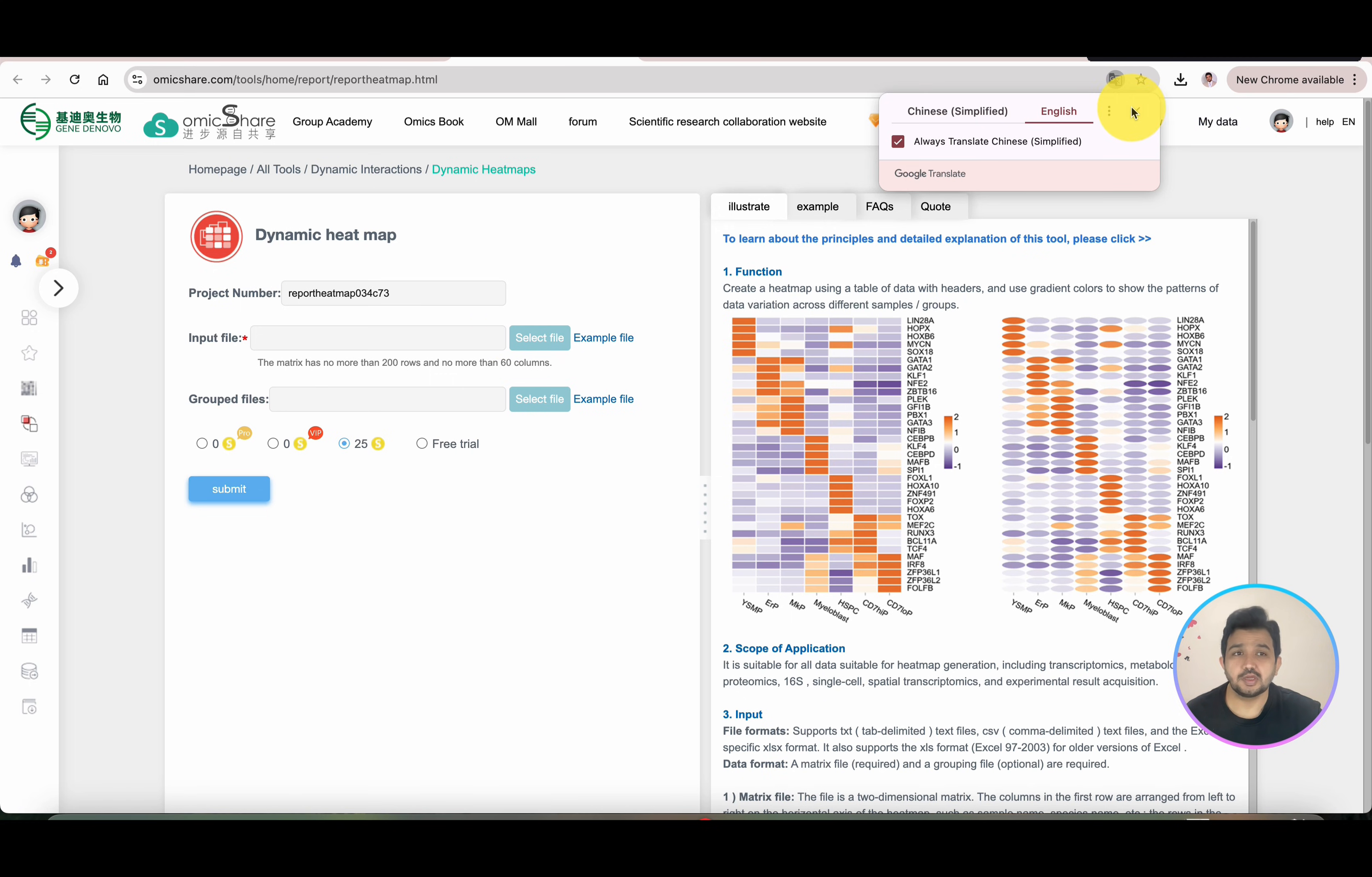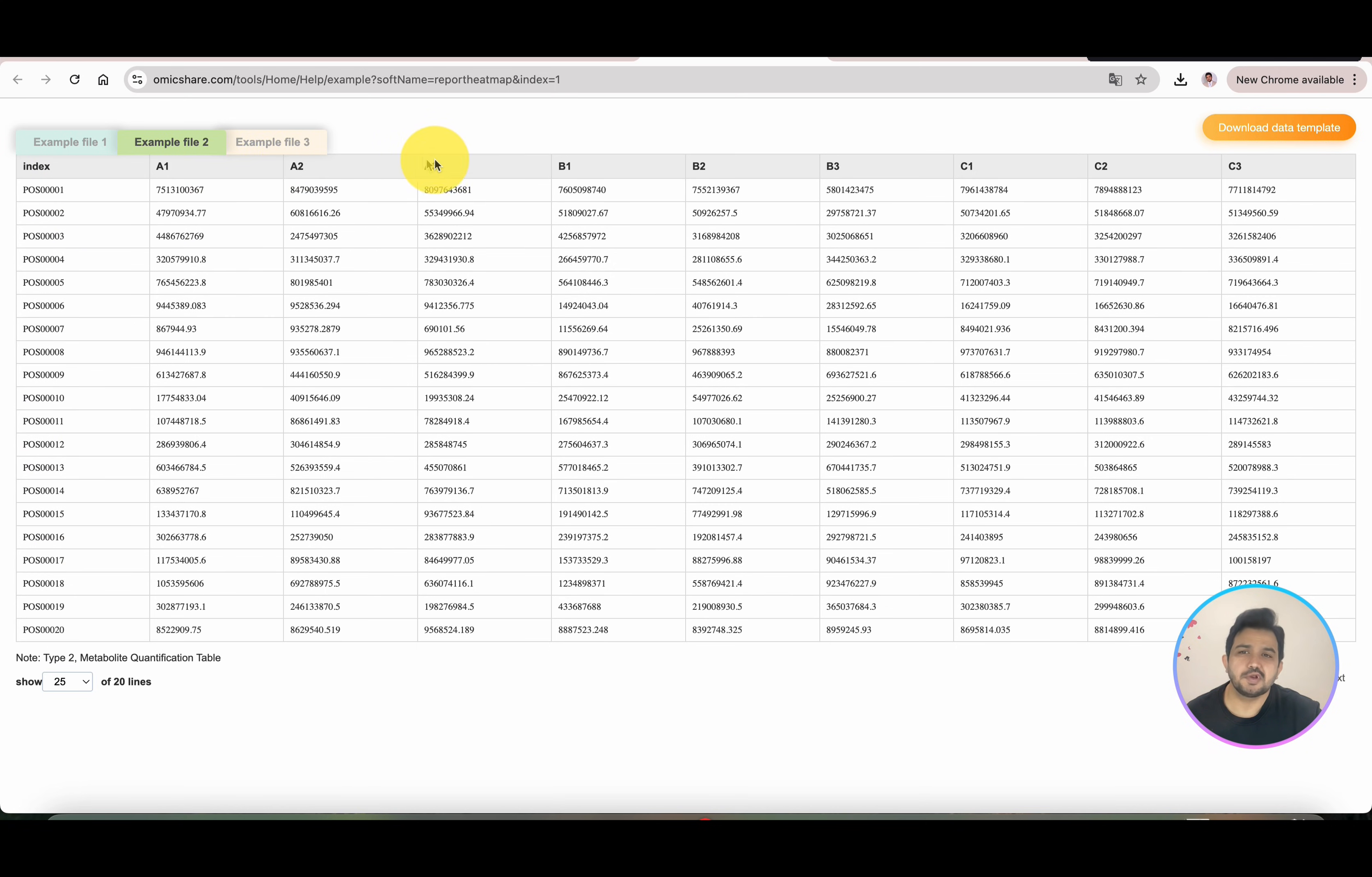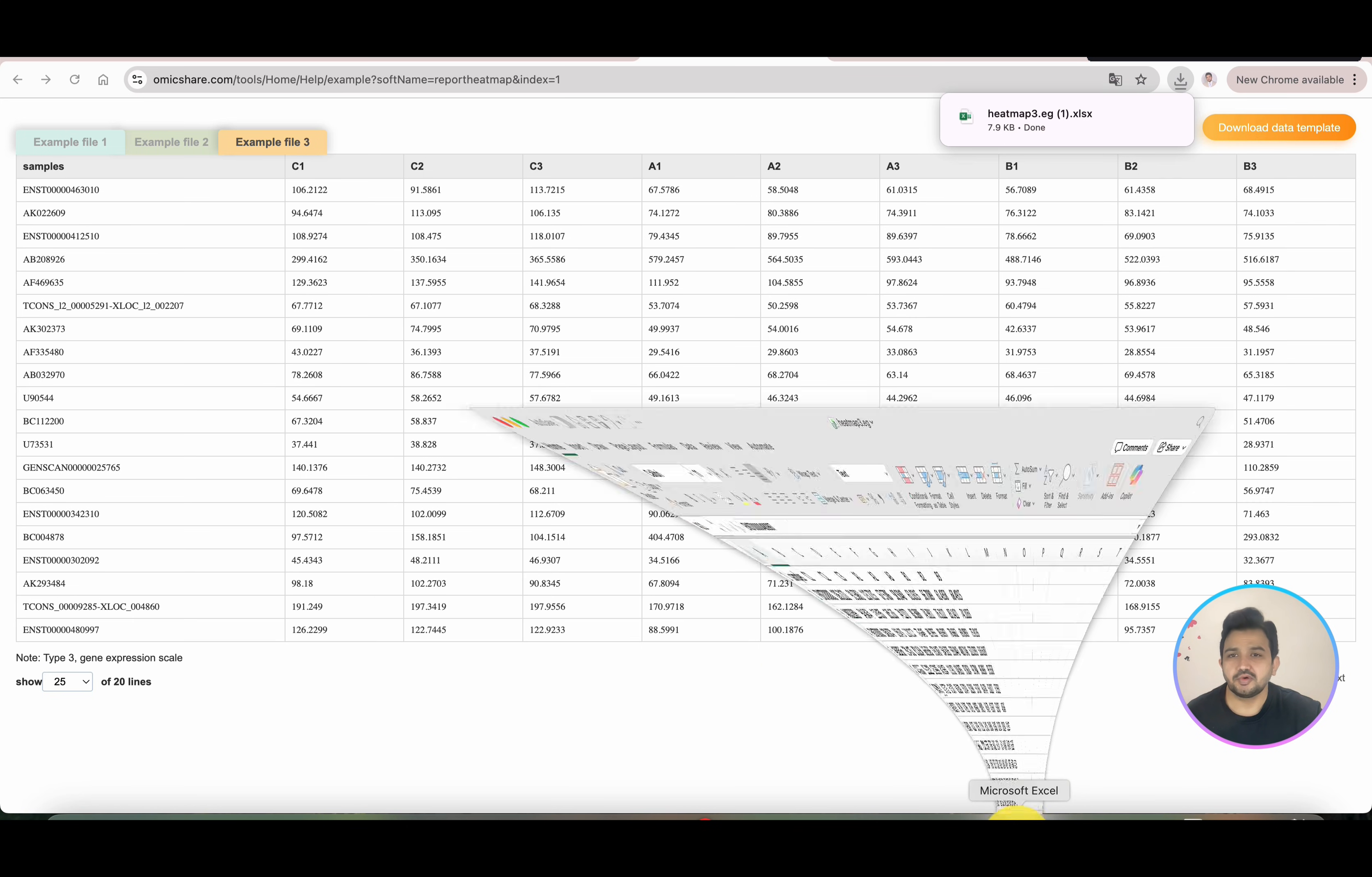I will show you how to prepare your input file. If you don't know how to prepare any example file for any tool, you can simply click on Example File. Here are three different example files. In the first column, there is the gene name, and then we have different treatments like A1, A2, A3, then B1, B2, B3, then C1—all the duplicate data. Here is example three, which you can simply download. Once you click on download, it will download this example file.